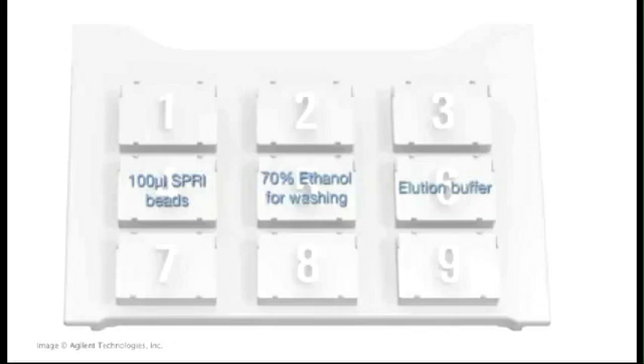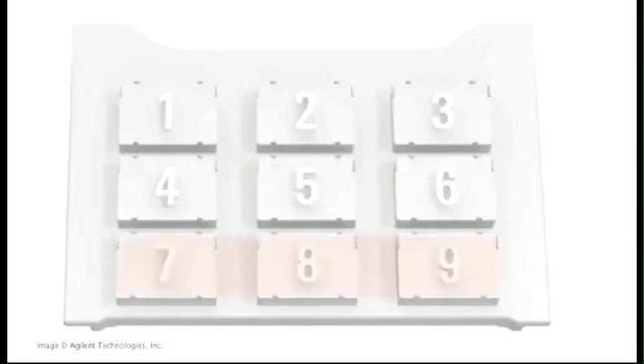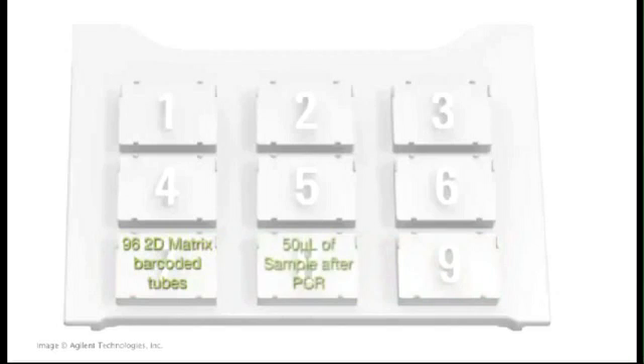All of the reagents are in 96-well plates to avoid cross-contamination from sample to sample. We decided this was a better alternative to open-source reservoirs. Across the front of the deck on the left, position 7, is a rack of 96 2D bar-coded matrix tubes, where the final cleaned samples will be transferred to at the end of the protocol.